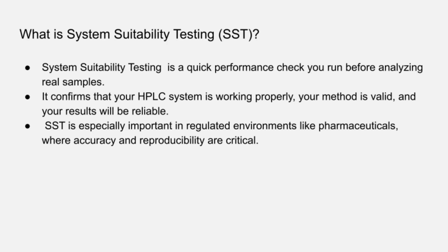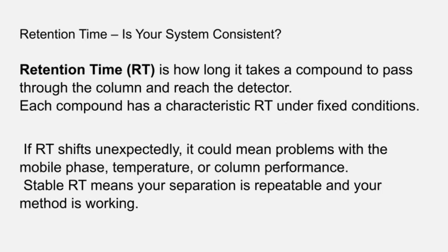There are various parameters used for SST testing. For this video, I will explain them using our website. Our first parameter is retention time.